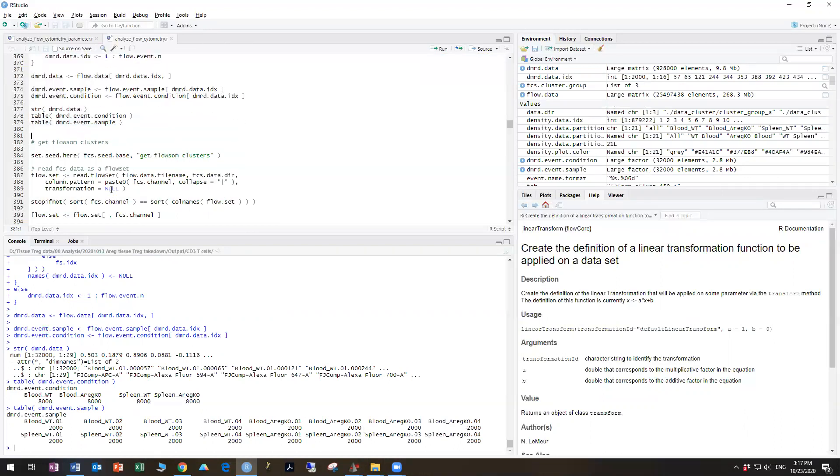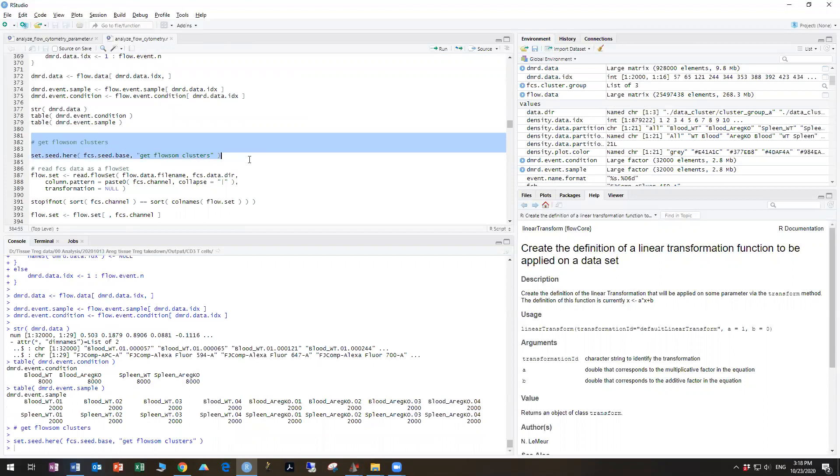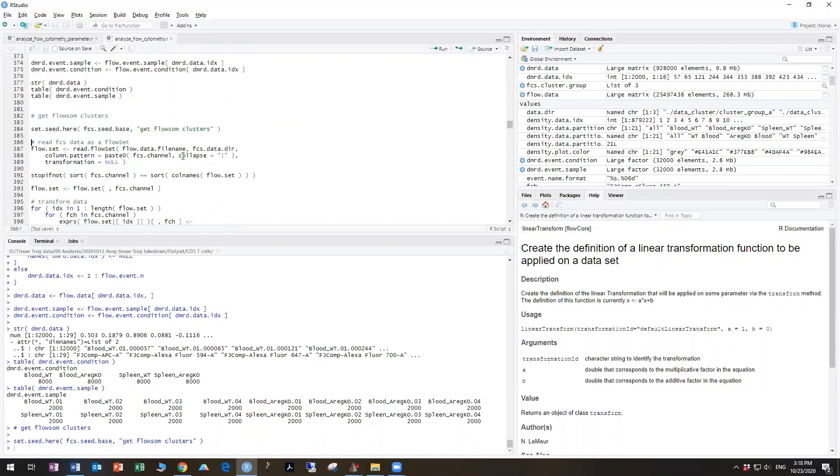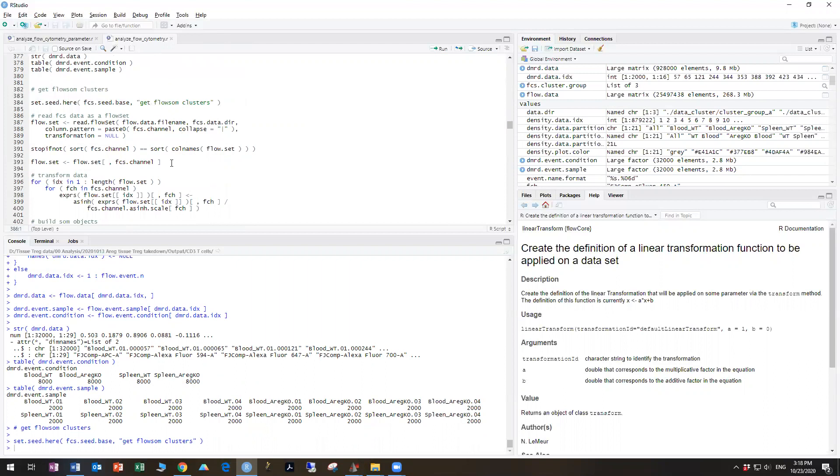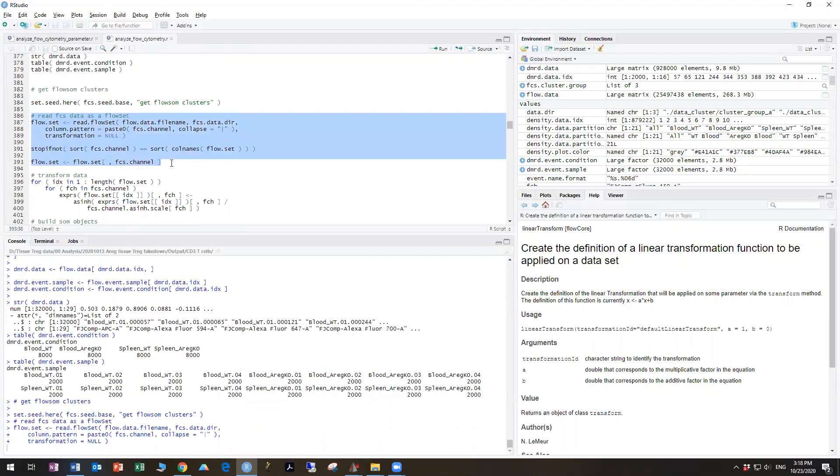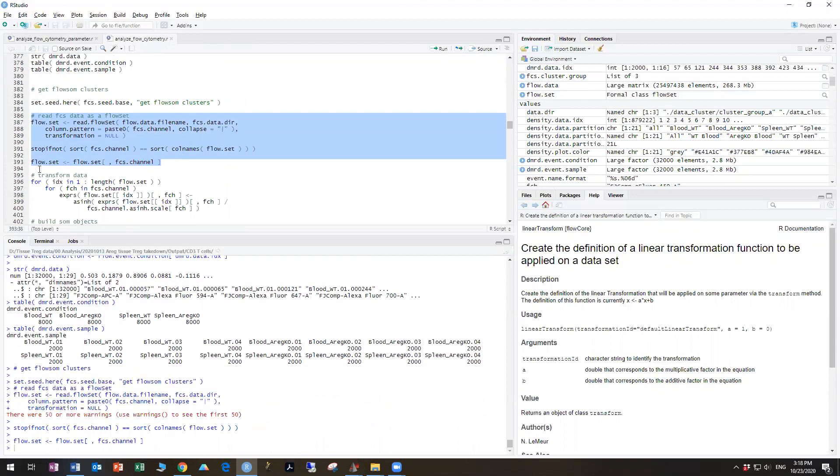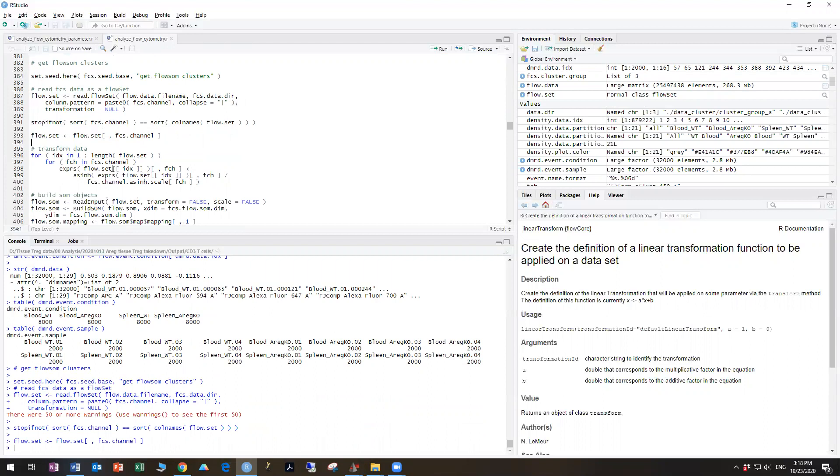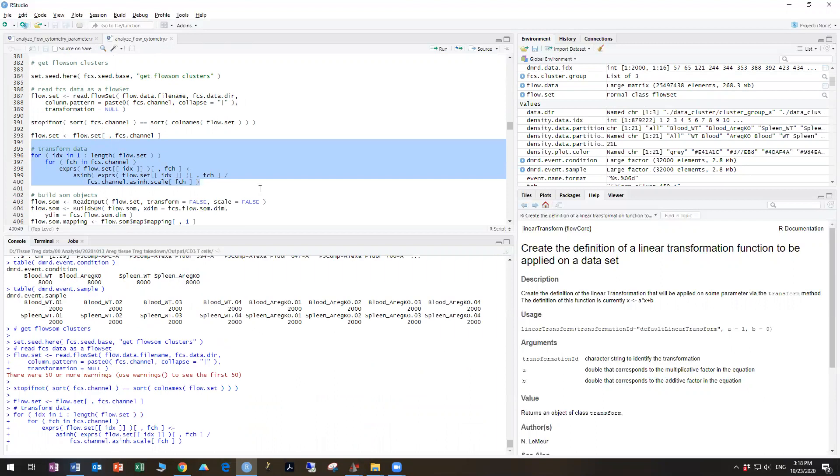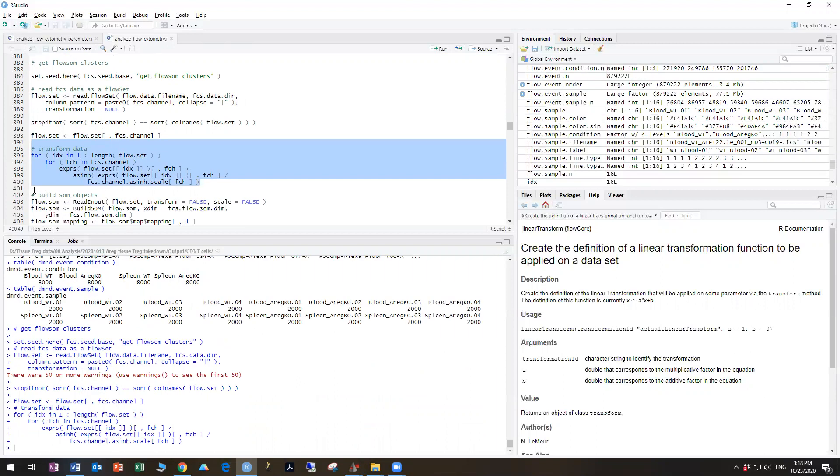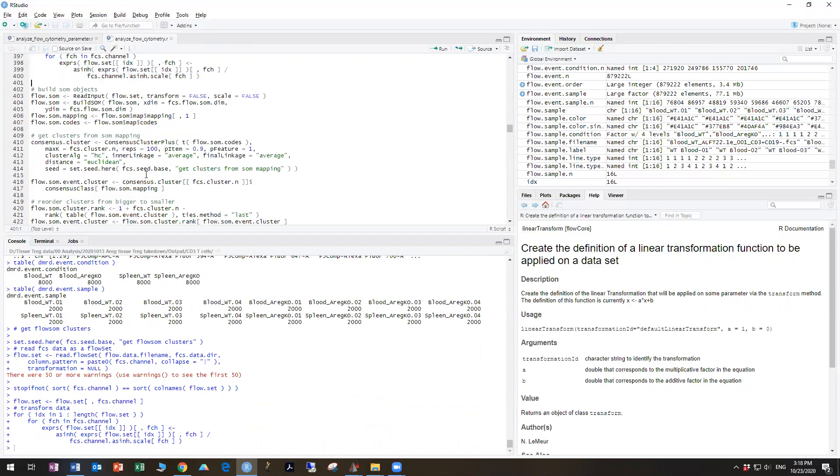The next part is to run FlowSOM clusters, so we're going to set the seed, and then we're going to read the FCS data as a flow set. Again, we get the warnings, which is due to the problem with the flow transformation and the data being slightly off-scale, and now we're going to transform the data and build the FlowSOM object.